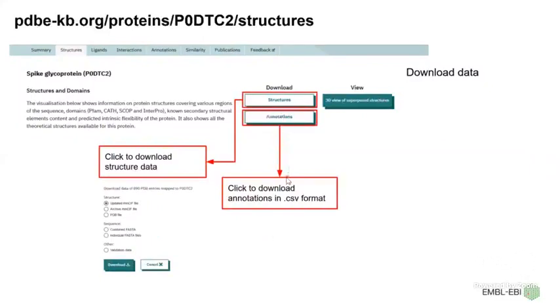All the annotations which you see in the Protvista viewer can also be downloaded in CSV format by the use of the annotation button.